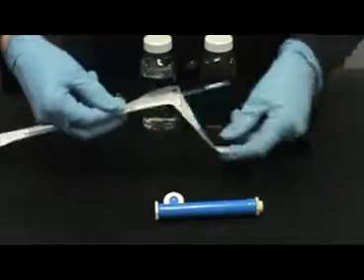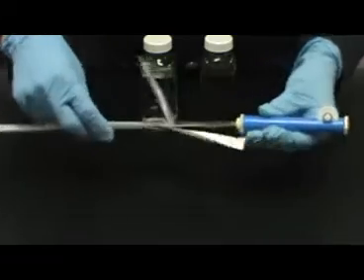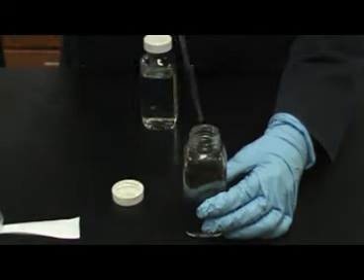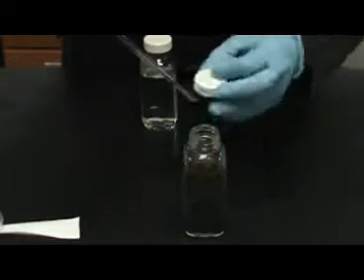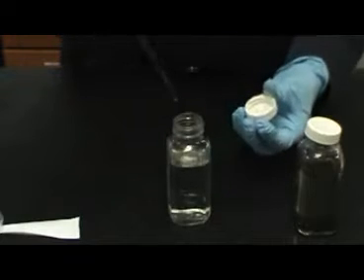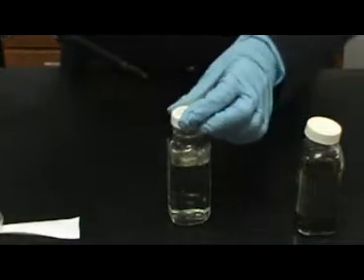You will now use a serological pipette to transfer 1 milliliter of your 10 to the negative 2 solution into another 99 milliliters of peptone. Remove the cap from the 10 to the negative 2 dilution, insert the pipette, and carefully measure 1 milliliter of solution. You will now place that 1 milliliter of 10 to the negative 2 dilution into the resulting 99 milliliters of peptone.